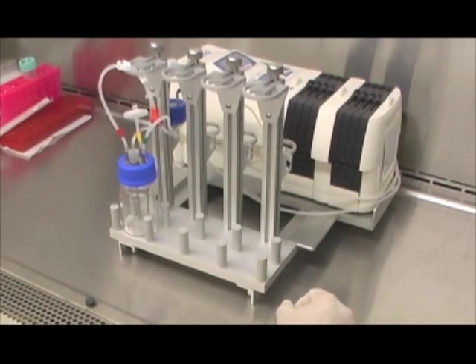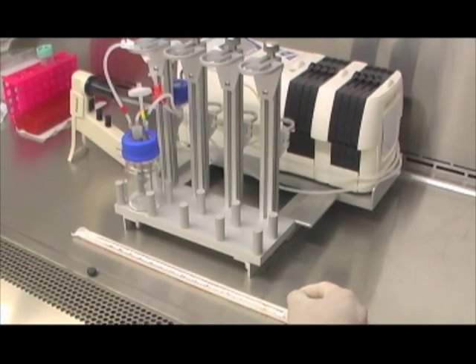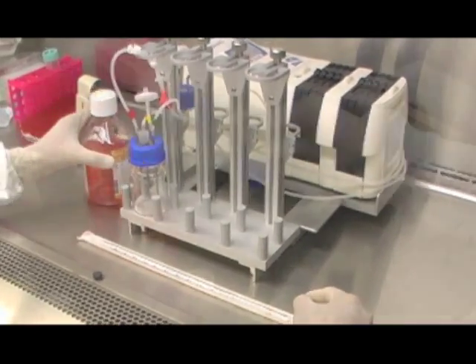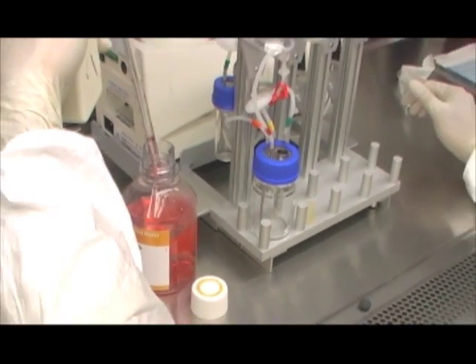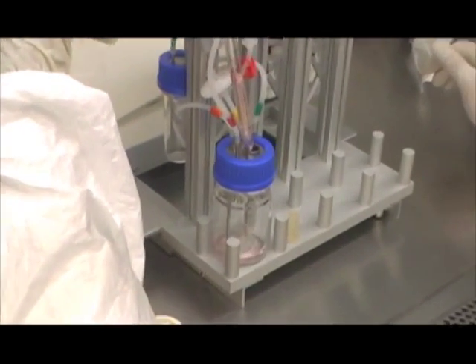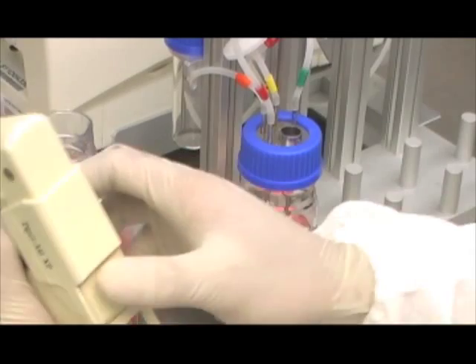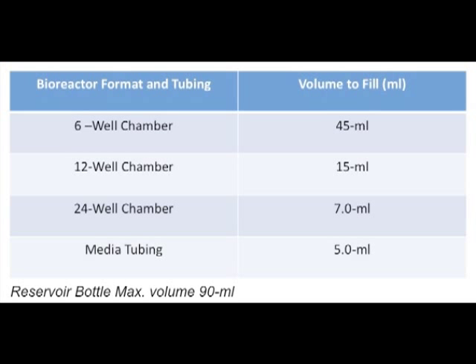In preparation for media equilibration, have cell culture media and serological pipettes ready. Media is only added to the media reservoir. Remove the clear silicon cap from the media reservoir, keeping strict aseptic conditions. Fill the media reservoir bottle with the required volume of media depending on your culture needs — the bottle can hold up to 90 milliliters. After filling, replace the clear silicon cap to seal the opening. This table gives exact pre-fill volumes for the bioreactor chamber formats and perfusion tubing, which must be taken into account when calculating the total volume for long-term cell maintenance.